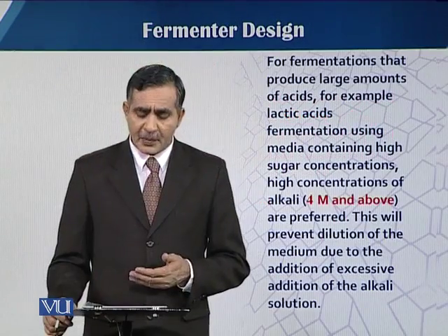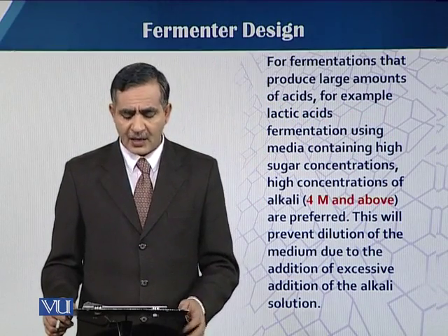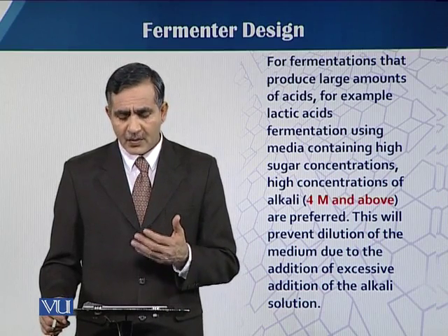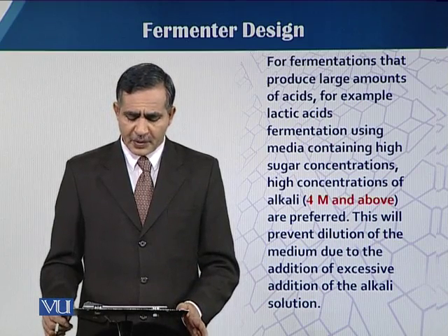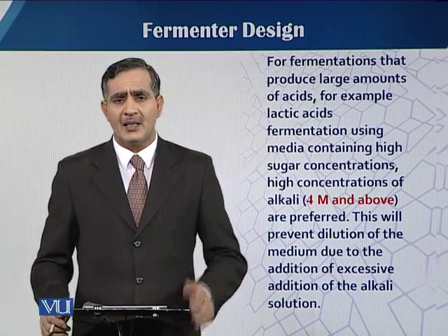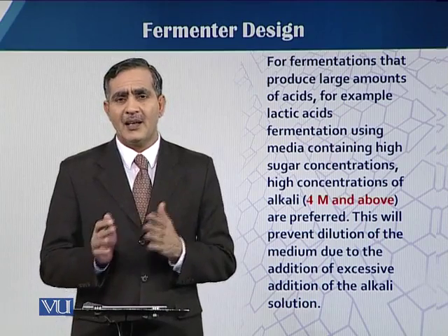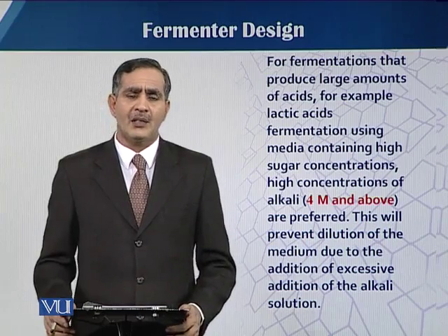For fermentations that produce a large amount of acids, for example lactic acid fermentation, a specific molarity is needed. Alkali that is 4 molar and above is preferred. This will prevent the dilution of the medium, because when we use a diluted neutralizing agent, that can raise the volume of the medium, which can affect the kinetic parameters. So we should use a specific strength and concentration of the acid or alkali agents which we use as a neutralizing agent.